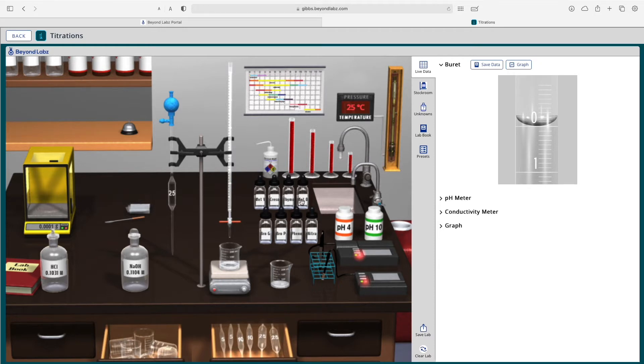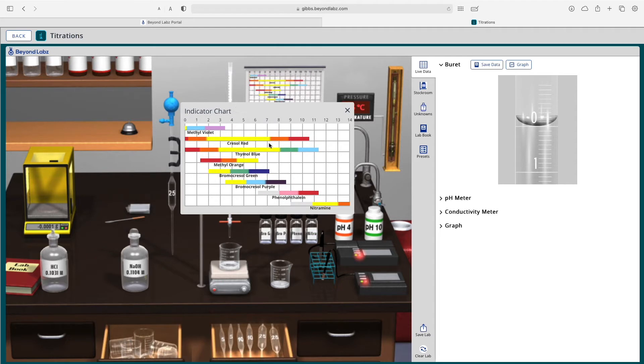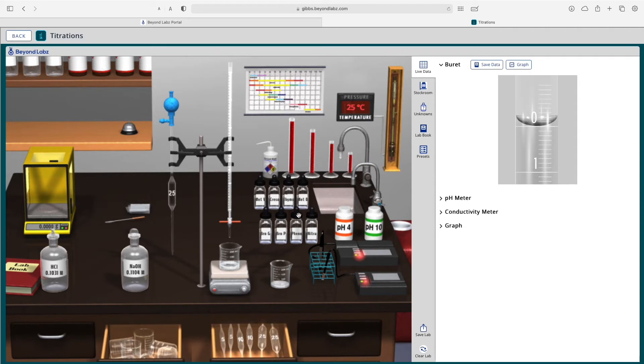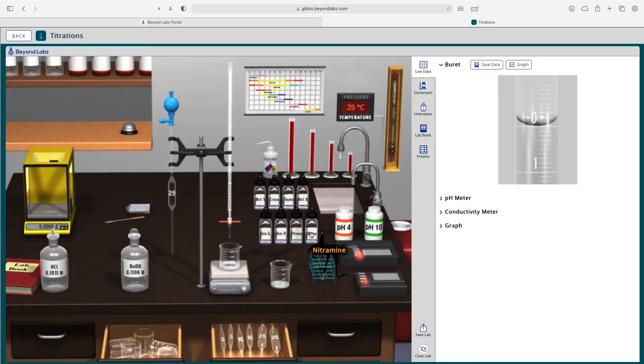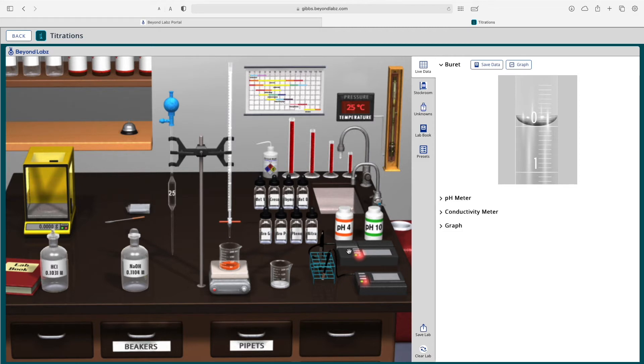You'll notice that I can add indicators into my reaction here and if I want to see maybe what's the best indicator I can click on the indicator chart and it will pull up the indicator chart where I can see, oh with this reaction we're looking for a pH 7 so I'm probably going to either want to use Bromocresol purple or Cresol red. So I'm just going to go ahead and use Cresol red, and if you hover over the indicator bottles it will tell you what indicator it is. So we can take this indicator, drag it to my beaker and then I can perform this titration using an indicator if I would like.